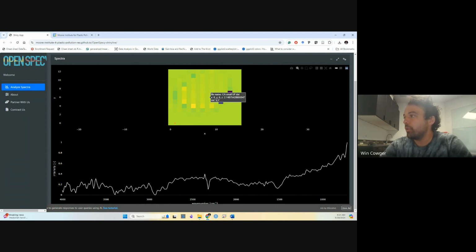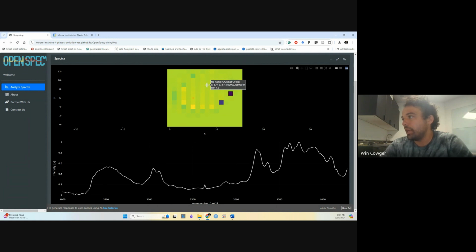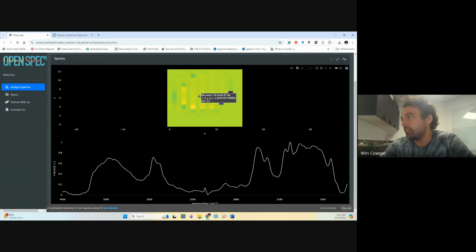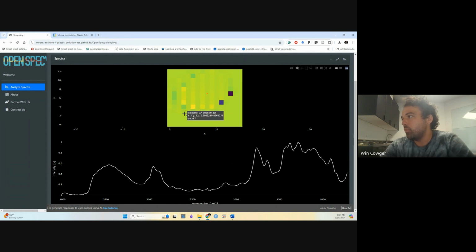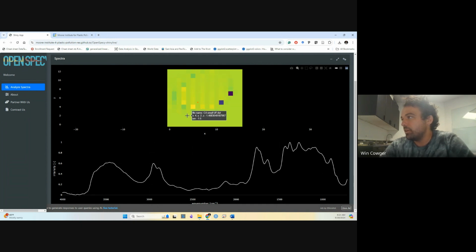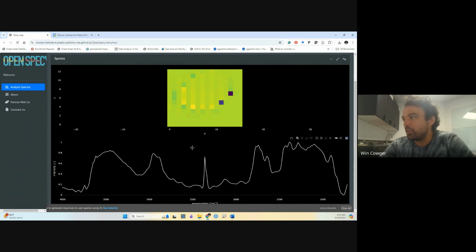Okay, so when you're clicking around, you're literally looking at different locations on this particle that's here in the middle, and you can see different spectra. One thing I want to point out is that the particle is basically here, and we're collecting these reflectance measurements that have this stainless steel background. And so one of the side effects of this is that near the edges, you can actually get some weird artifacts. So you'll get these spectra that are kind of half stainless steel, half particle.